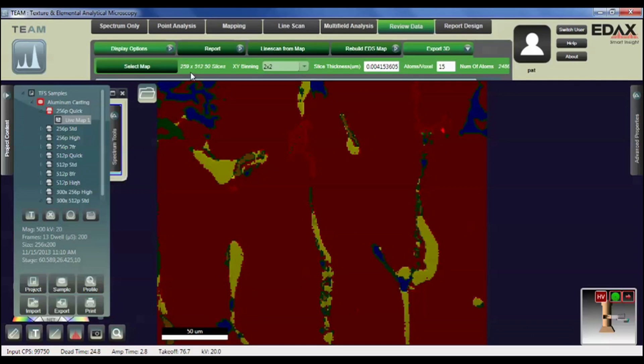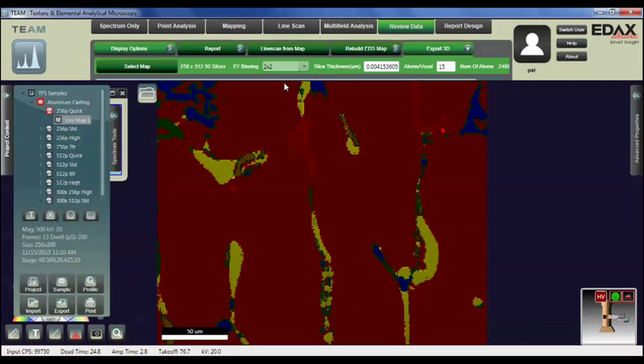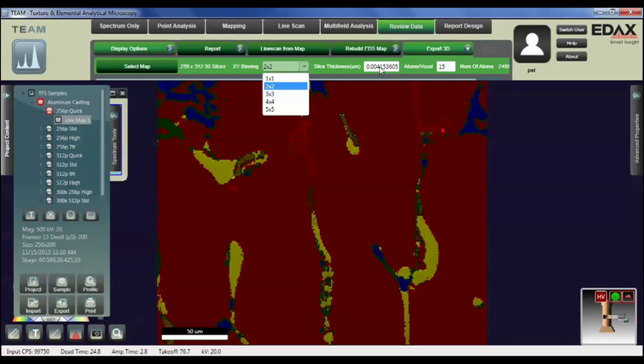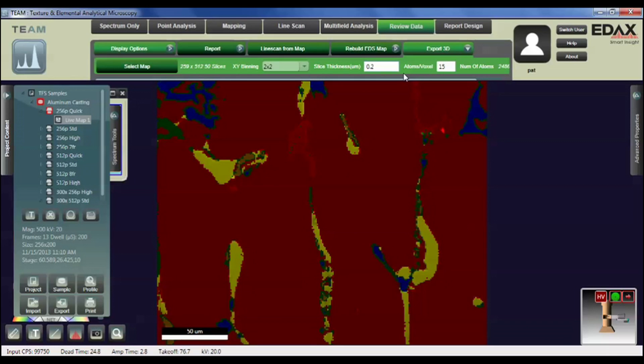And when it comes back, it shows us that the maps that I've selected are 259 by 512 pixels. There are 50 slices. We can bin the data to increase the statistics in case it has a little bit low statistics that we're doing. I've selected 2 by 2, but we could select 1 by 1 all the way up to 5 by 5. We can then input a slice thickness at the present time for this in microns, and these slices were 200 nanometers apart, so 0.2 microns.